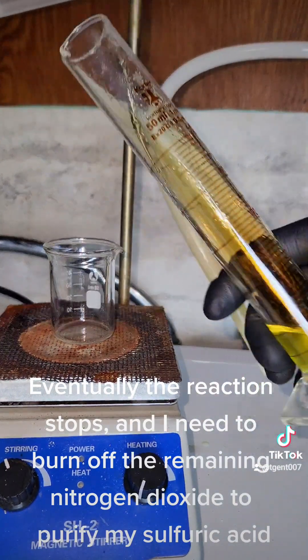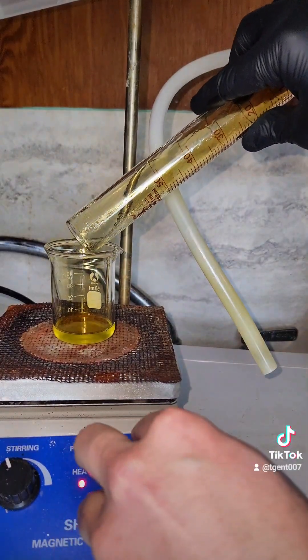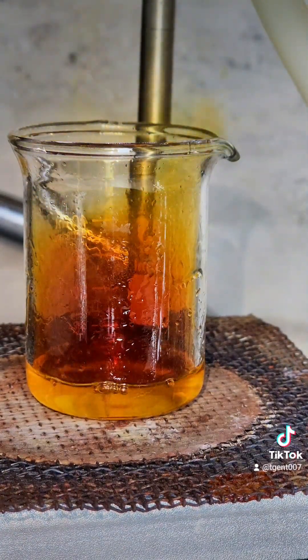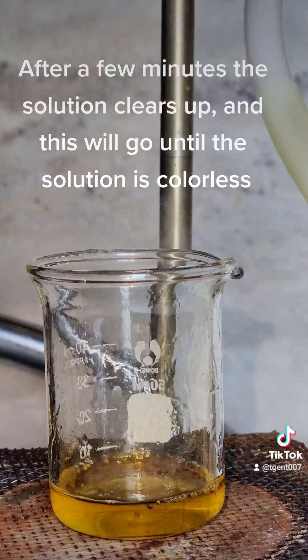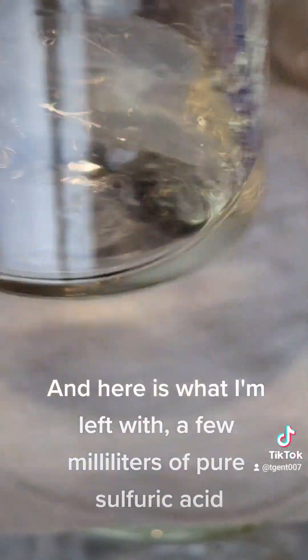Eventually the reaction stops, and I need to burn off the remaining nitrogen dioxide to purify my sulfuric acid. After a few minutes the solution clears up, and this will go until the solution is colorless. And here is what I'm left with — a few milliliters of pure sulfuric acid.